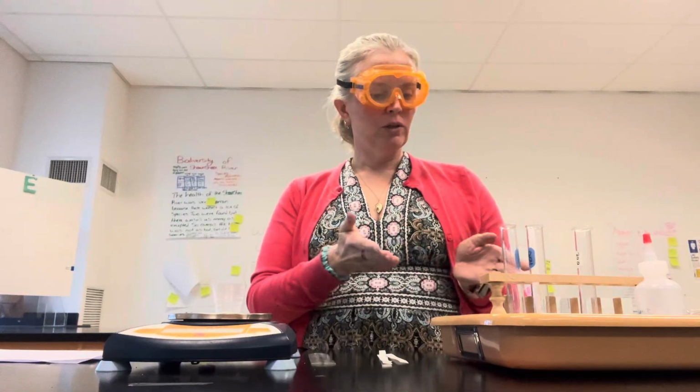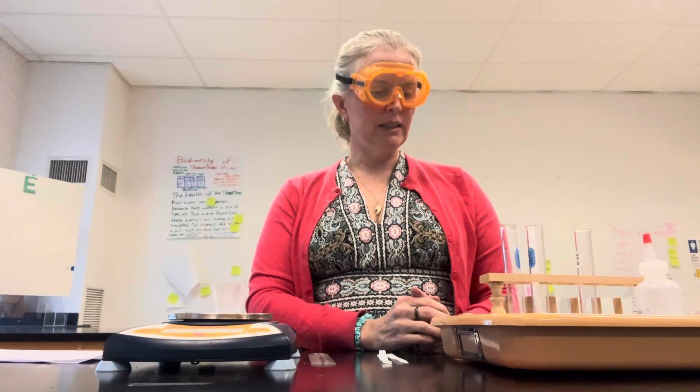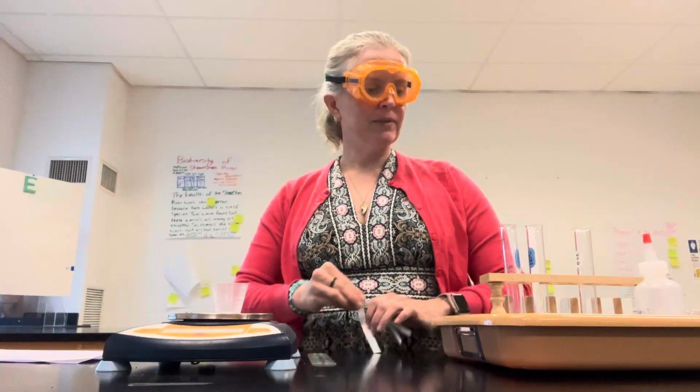And then once you're finished, to clean up, we're just going to throw out the used strips of paper, and you can dump a small amount of alcohol and water down the drain, but you should turn the water on when you do so, and you should wear your safety glasses if you're the one that's doing that. Okay, that's it. Good luck.